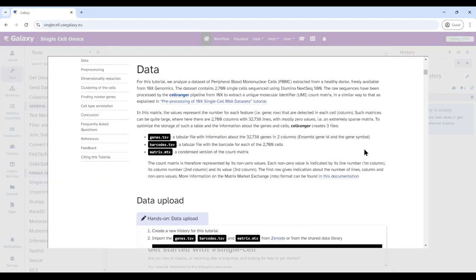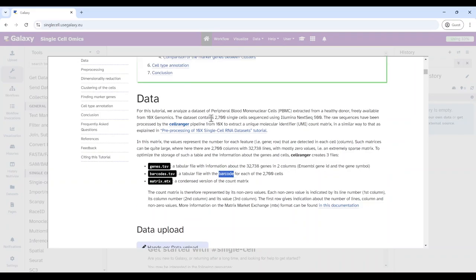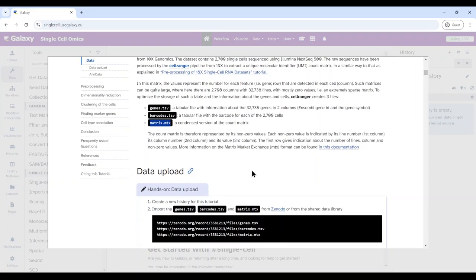The dataset contains mainly three files. The first is genes.tsv — a two-column tabular file with Ensembl gene IDs and gene symbols. There's also a barcodes file, which is simply a tabular text file with barcode information. And there's a matrix file that contains the counts information, in a format called matrix market exchange format.